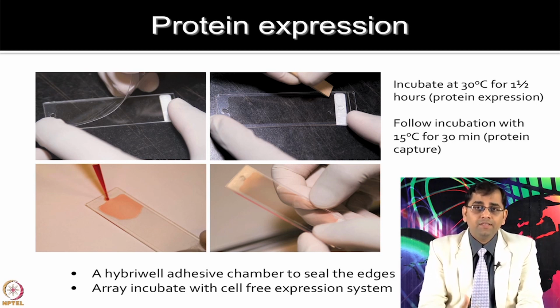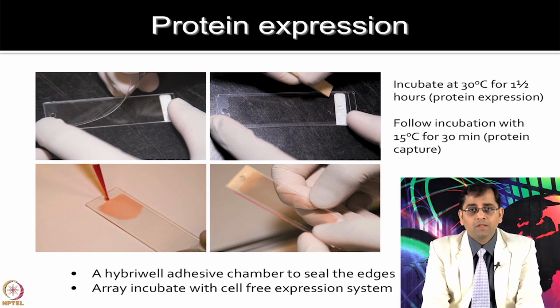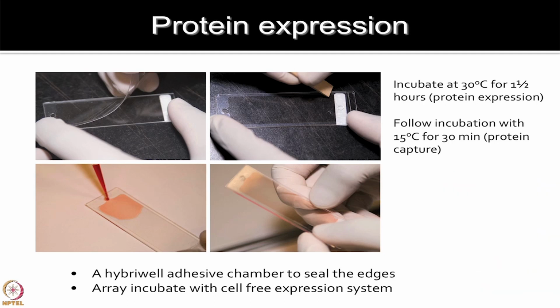Once you are ready with this part, you can incubate at 30 degrees for 1.5 hours, and then lower the temperature for the capture step to 15 degrees for 30 minutes. Now, starting from the DNA on that day, you have the proteins made on the same chip.